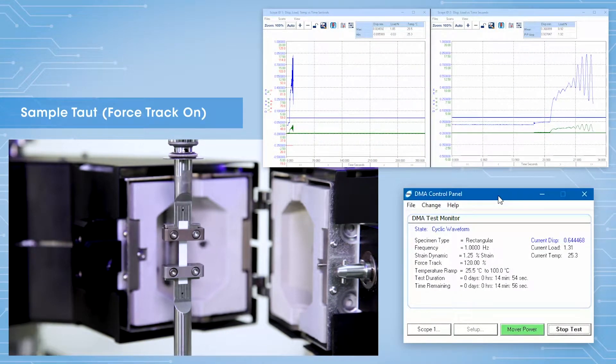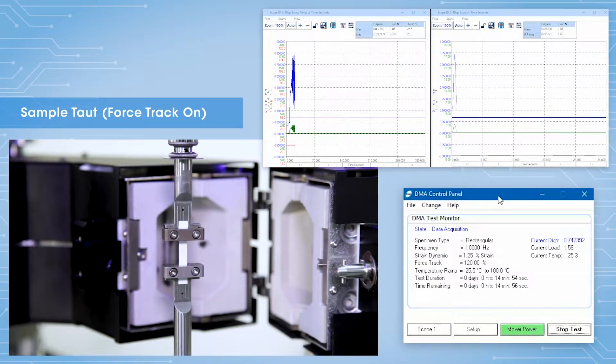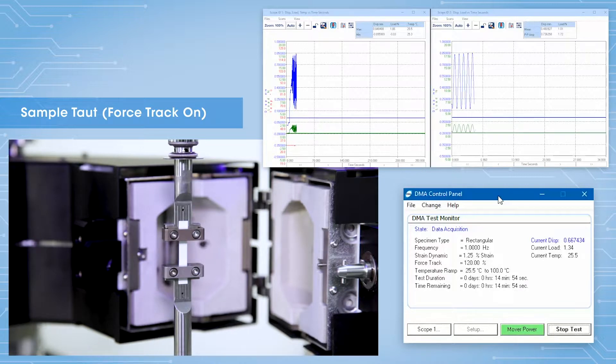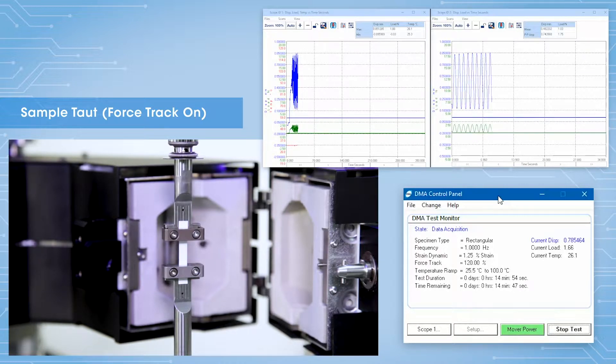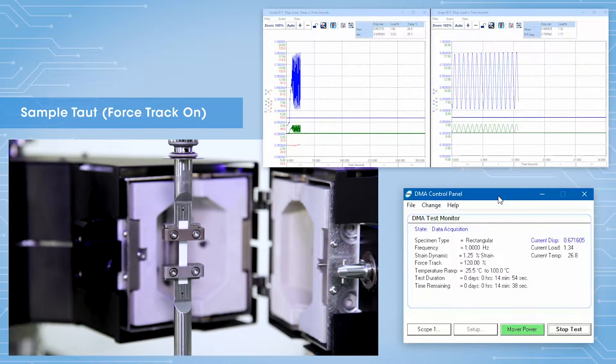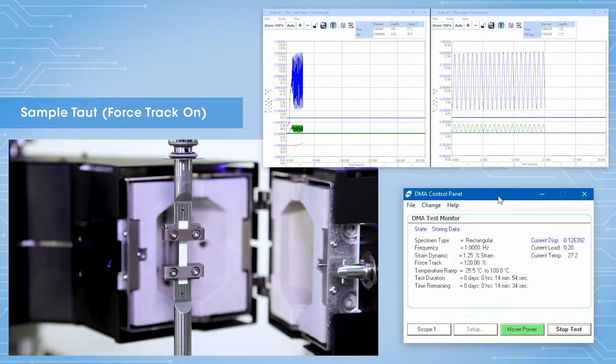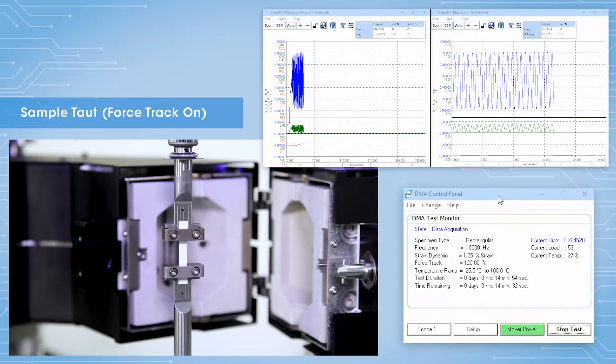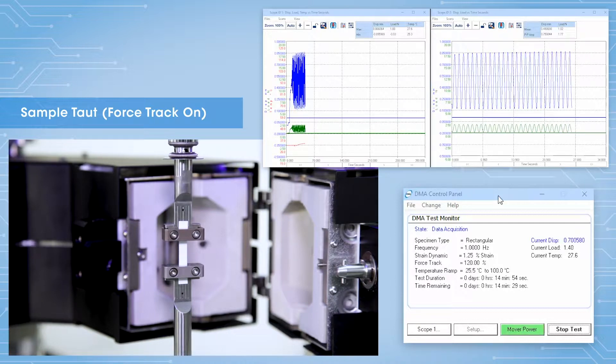When you use a tensioning clamp like the film clamp or tension clamps, sometimes you need to impose an additional static force above the oscillation force to prevent the specimen from buckling.